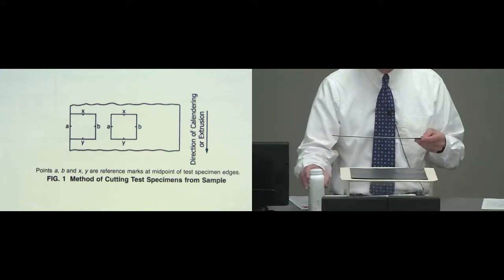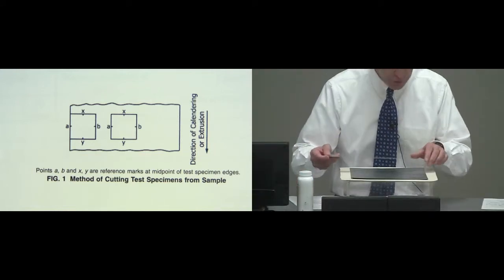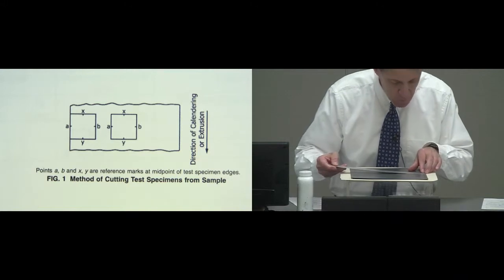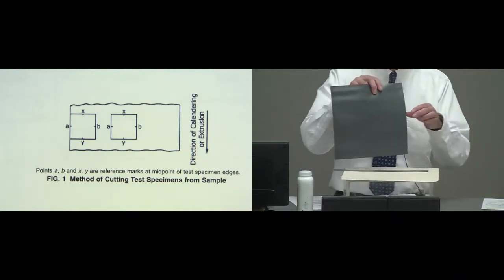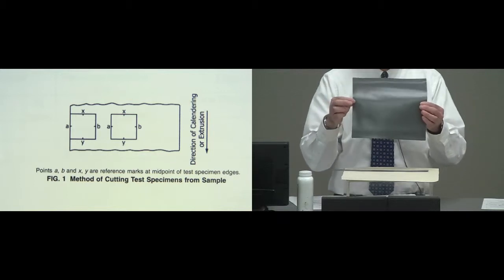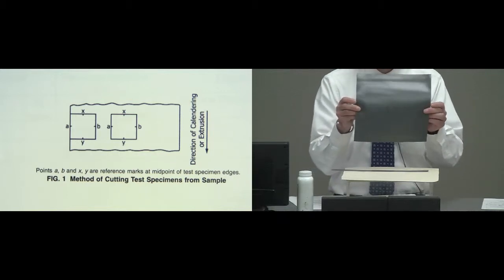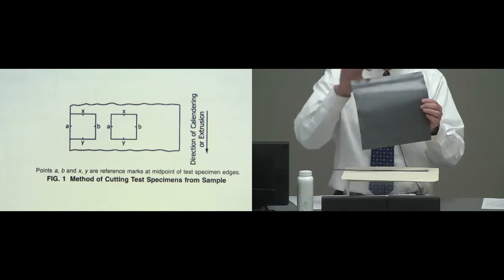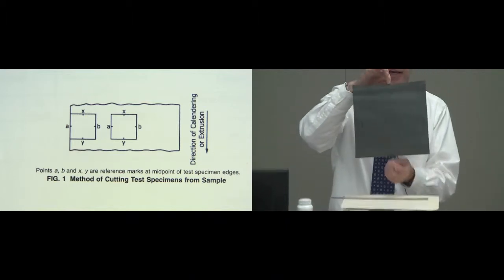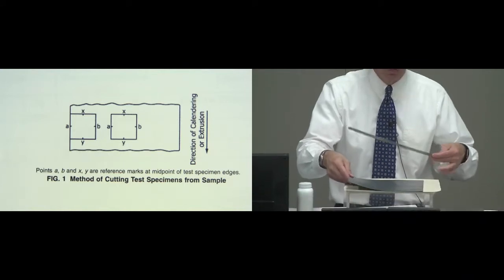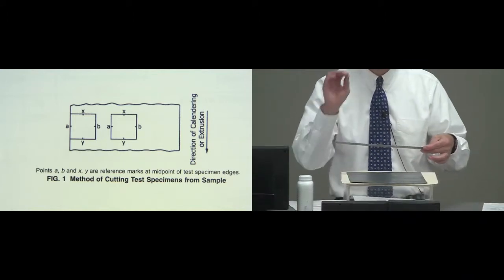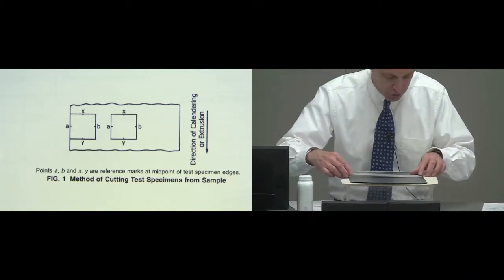So I will measure the transverse direction first and that is facilitated because I previously marked the midpoint of the transverse direction with these two black marks and the machine direction and then after heating I just measure between those two black points again. So I'm measuring the same point across the geomembrane.